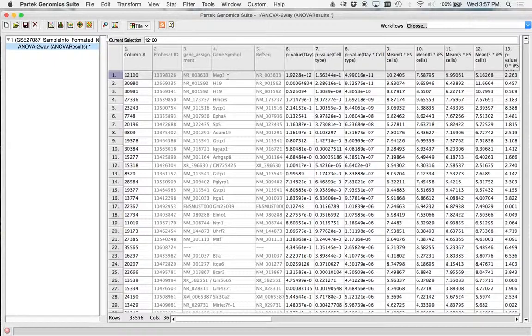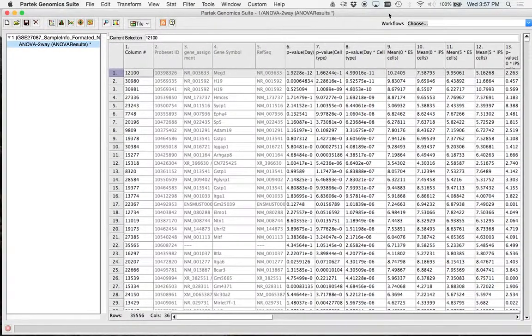Okay, so we showed how to display this, basically a dot plot. Now that we got the numbers, we can take a look at all kinds of stuff. When we looked at the PCA, we pretty much knew that we were going to find lots of differences, right? There was no doubt about that. When you summarize the data and they basically end up in three distinct areas in three-dimensional space, something's different.